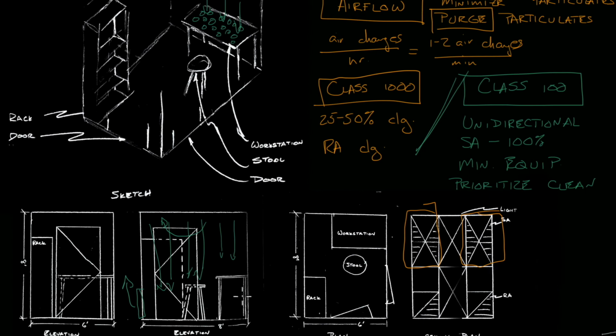Well, what do I mean by first? I mean that if you have, let's say, some shelf right here, and even though things can flow through it, it's perforated, let's say it has a bunch of particulates on it, that means everything downstream will get those particulates. And of course, the primary source of particulates isn't some shelf, it's a person. So that means that the air is cleaner up above, dirtier downstream or down below, which really is no big deal when the air is coming from above.